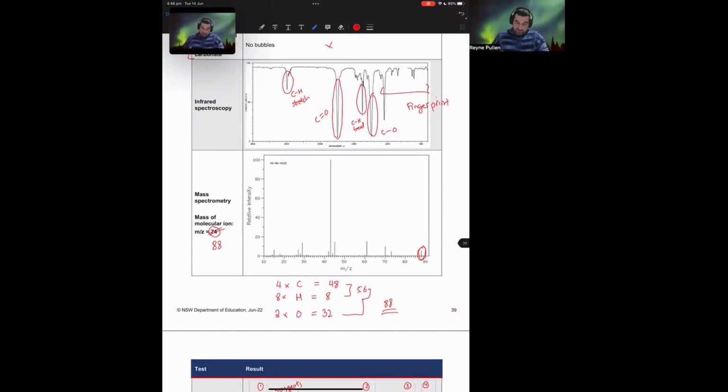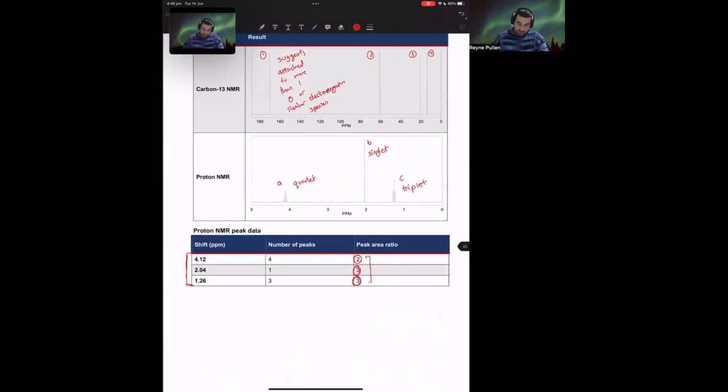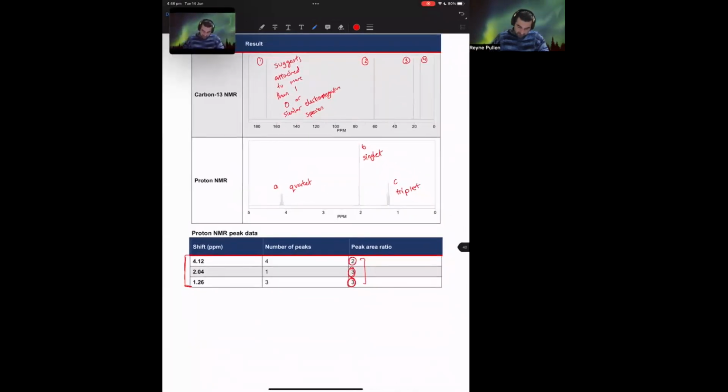So if we try to put this all together now, we can maybe start in the middle and say, well, there must be a carbon that has a double bond oxygen, and a single bond oxygen coming off of it. Now, there are 3 other carbon environments present.